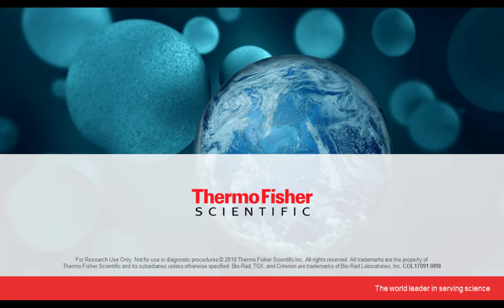Yes, so the answer to that, if I understand this correctly, the question is, with precast gels, can you use home-brewed gel running buffer? So the answer to that is yes. Obviously, you have to be mindful that you are using the right buffer for the right chemistry. So for example, Tris-Glycine gels, there is Tris-Glycine running buffer.